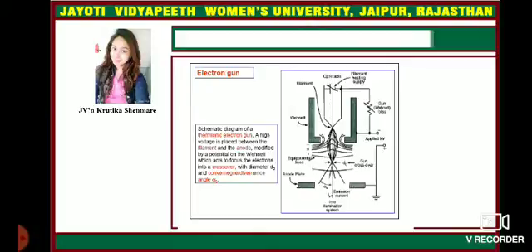This is a schematic diagram of an electron gun. A high voltage is placed between the filament and an anode, and a potential on the Wehnelt acts to focus the electrons into a crossover with diameter d0 and convergence or divergence angle alpha 0.